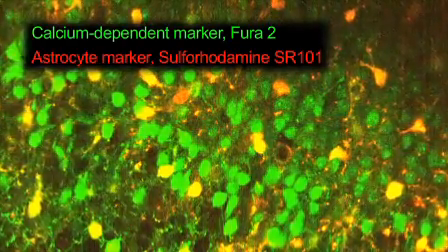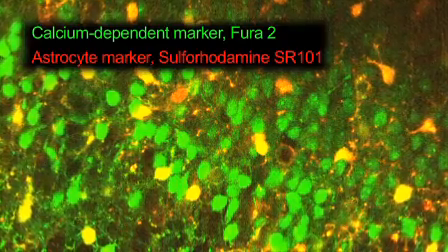Changes in the fluorescence of calcium-dependent dyes reflect changes in cellular activity.